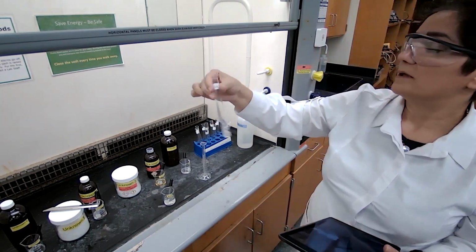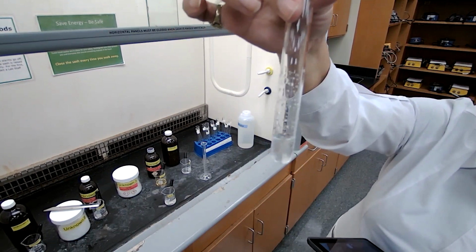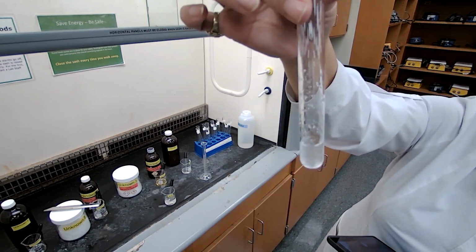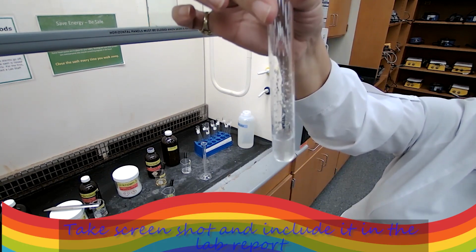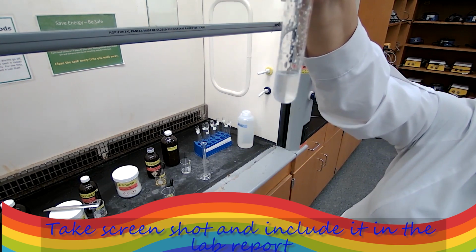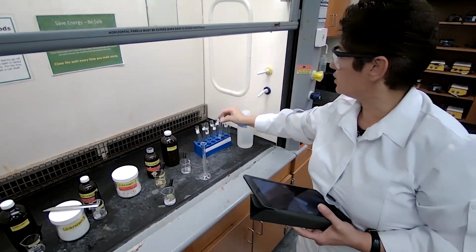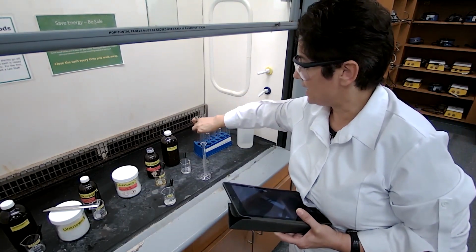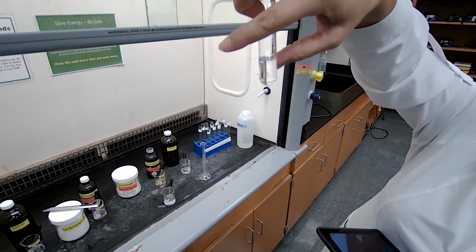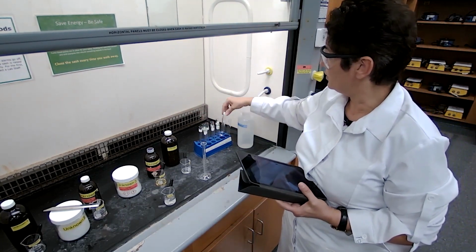Unknown 4 is a liquid, very similar to unknown 2 because it's cloudy, and droplets of oil come down and go up, so that's not soluble either. If it was soluble, you would have seen a very clear liquid in the bottom portion. So unknown 4, not soluble.